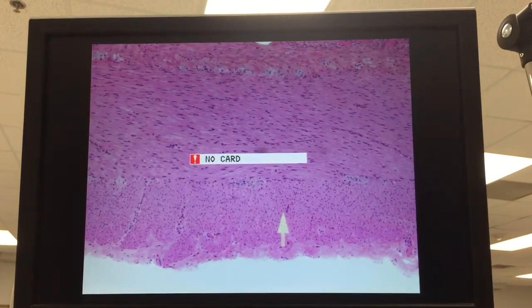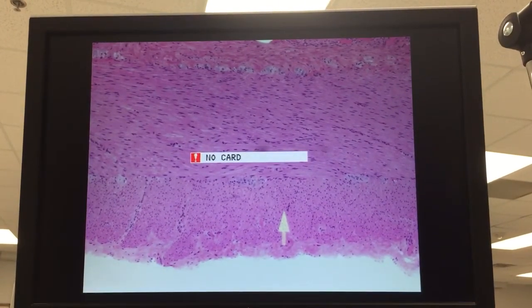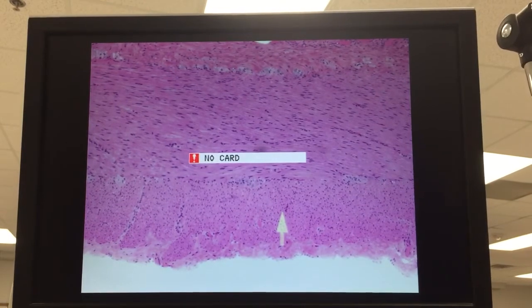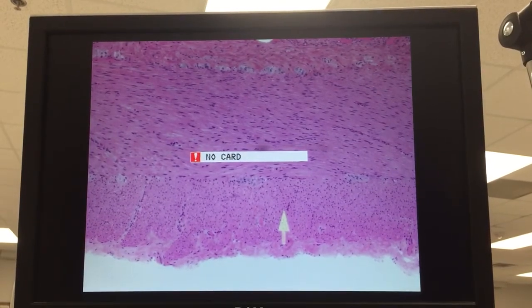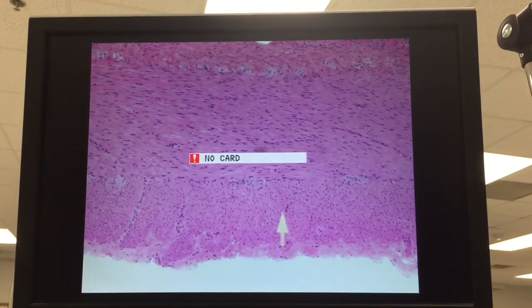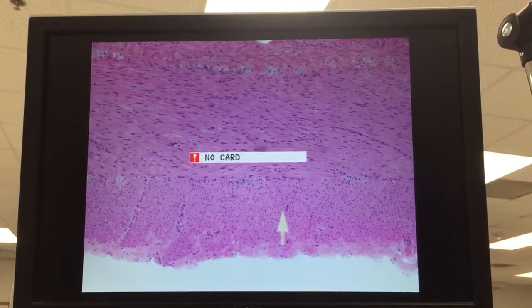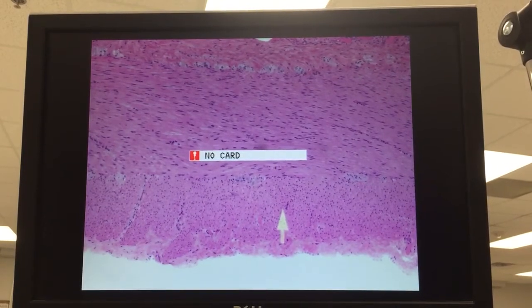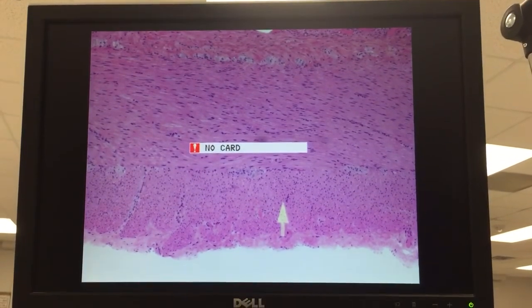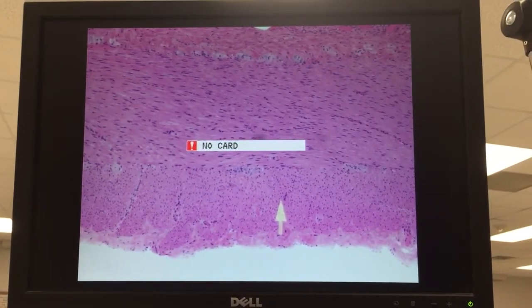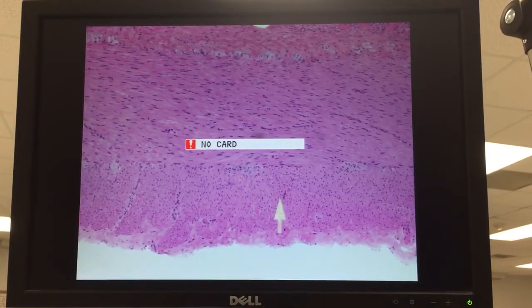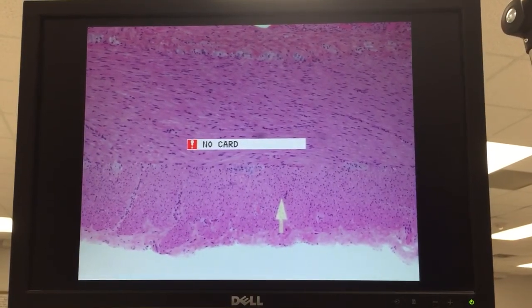And in this case we have an outer longitudinal layer. When we get back from next week or the week after — whenever we get back to another lab after the lab practical — I'll put up some demonstrations of the GI tract, including taenia coli from a monkey colon. And this will have that up on demonstration, and also perhaps some enteroendocrine cells.